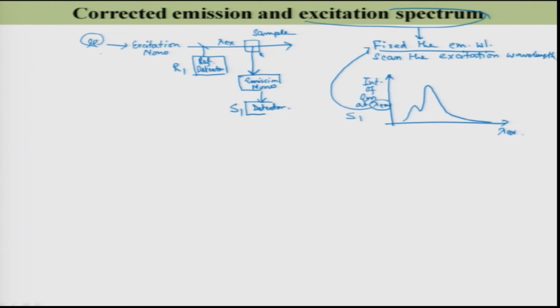But on the other hand, this looks something like this. So, this output intensity of lamp versus wavelength, this is nothing but this lambda excitation, is like this. So, when the lambda excitation is over here, obviously the fluorescence intensity will be small. When the lambda excitation is like this, then fluorescence intensity will be more, obviously. It also depends on the absorption spectra, that let me show.